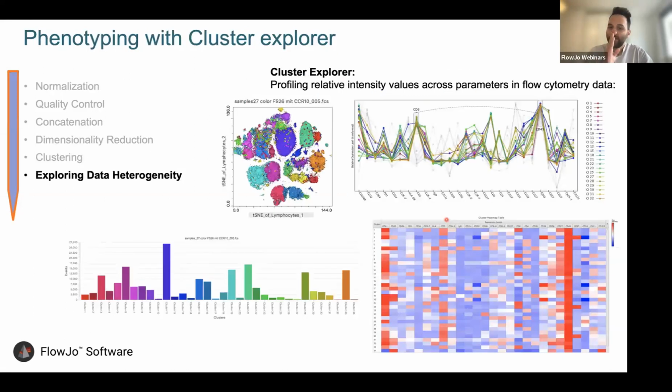Then the next step is Cluster Explorer. Cluster Explorer is not going to perform a new analysis or generate new populations, it's just going to combine whatever we have gathered so far. With Cluster Explorer, we get a series of four different windows where we can interact.